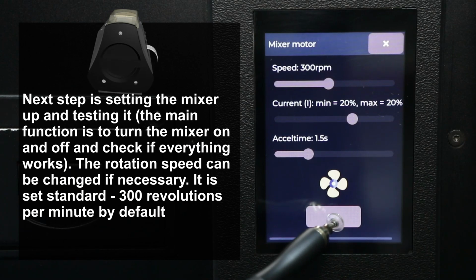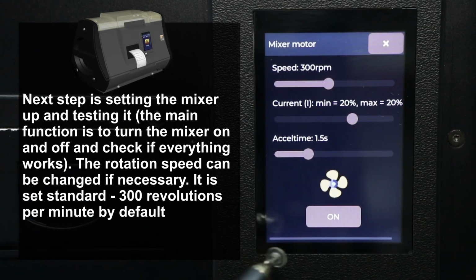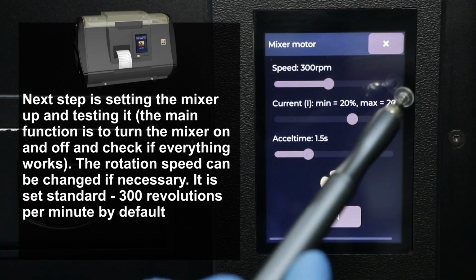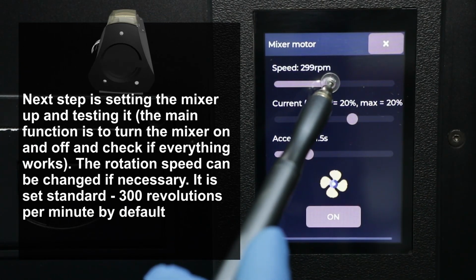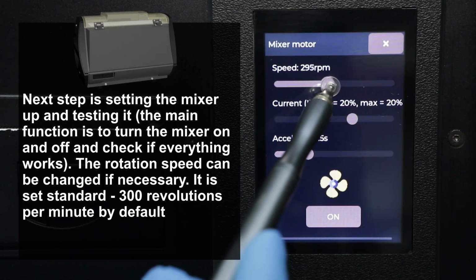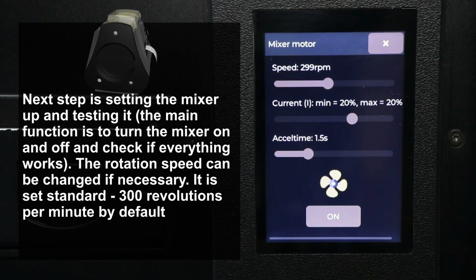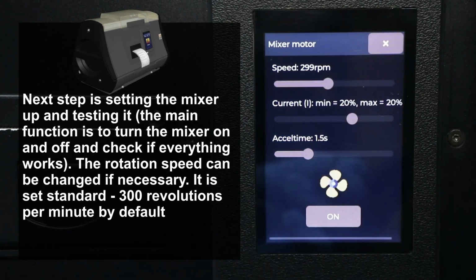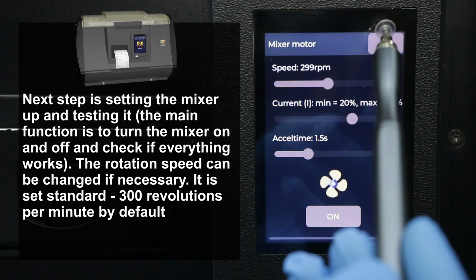The main function is to turn the mixer on and off and check if everything works. The rotation speed can be changed if necessary. It is set to standard, 300 revolutions per minute by default.